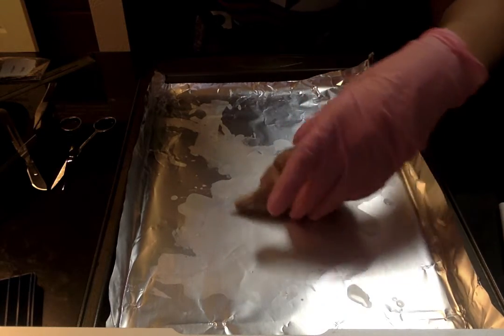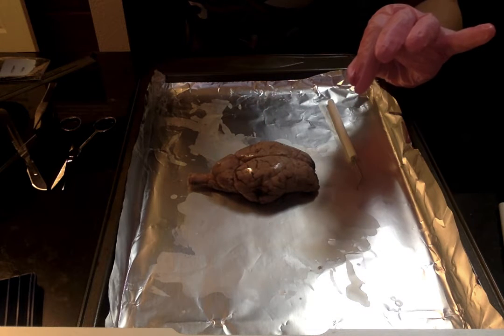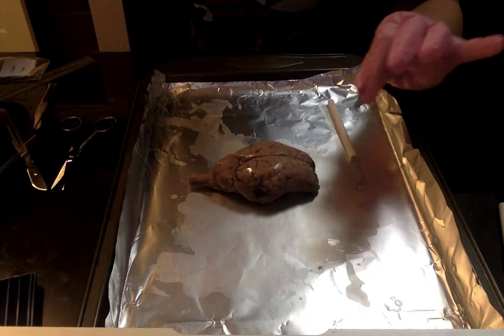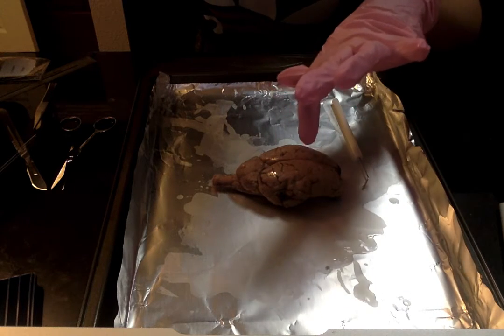So we notice that the brain has two halves or hemispheres. We also see the difference between the cerebrum and the cerebellum. The cerebellum is going to be right here, and this is going to be the cerebrum area.